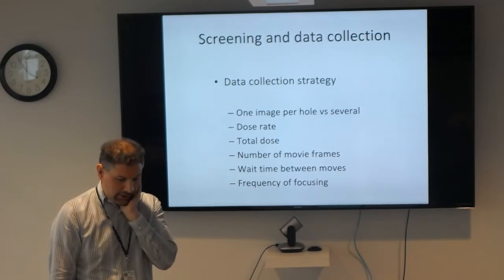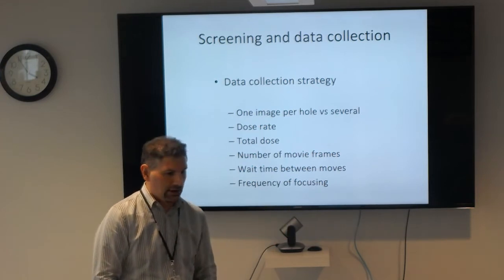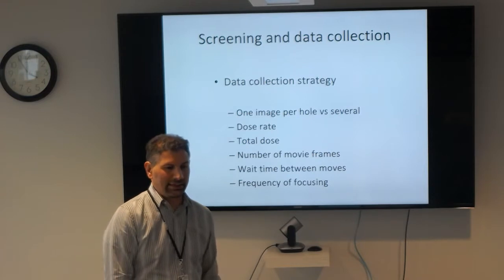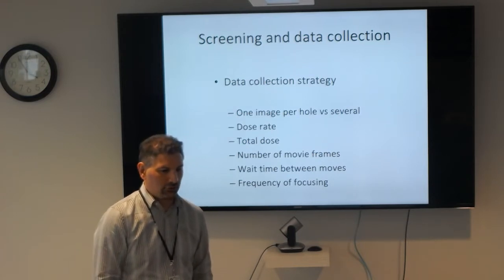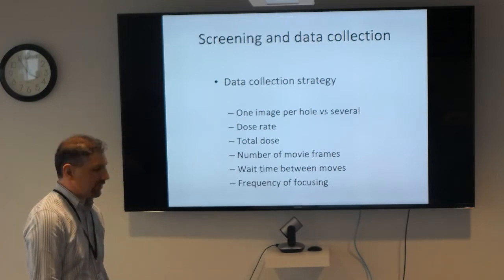So then with the data collection strategy, as with everything, as with crystallography, there are many different strategies, and all of them seem to be working. And I think at the end of the day, you can use many different ways to get at your structure, but at least this seems to be converging on one theme.